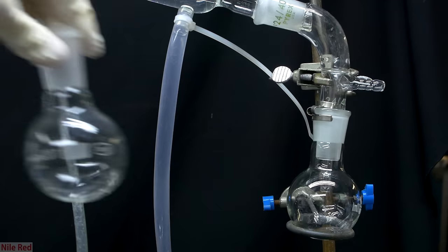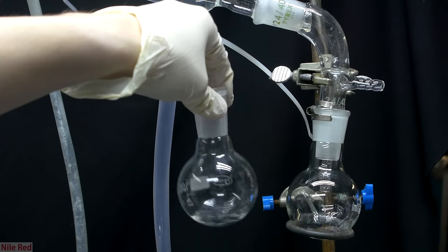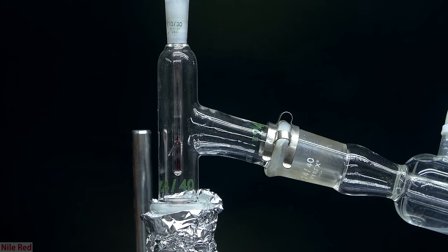Acetone boils at around 56°C and this is what we want to collect, but a lot of stinky stuff actually comes over much below this. On the left, I quickly show everything that came over below around 53°C, and after 53°C, I swapped out the receiving flask. After it was swapped out, I proceeded to collect everything that came over between 53 and 56°C. The boiling point of pure acetone is around 56°C, so this is a good indication that we are in fact collecting acetone. What we do here is keep collecting the acetone, and as soon as the temperature rises above 56°C, we stop the distillation.